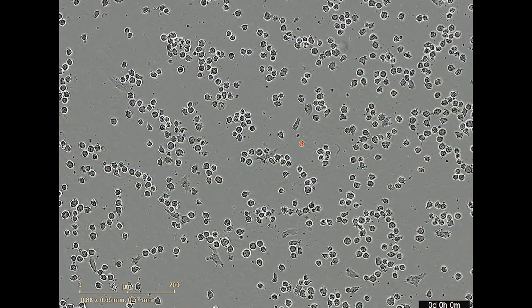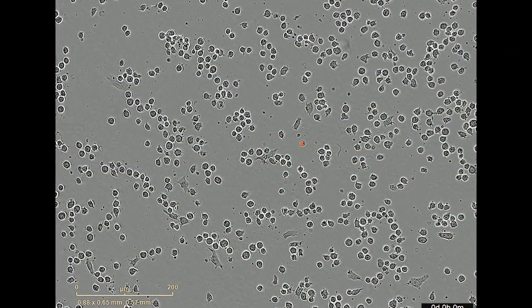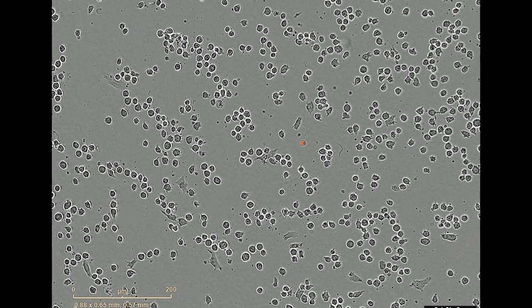Here we can see the small round non-adherent THP1 cells at approximately 200X magnification in phase contrast.